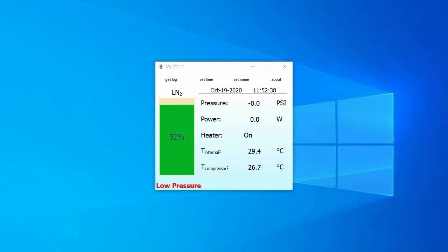If the Intelligent Cryo-Cycle unit has a warning or alarm, a descriptive message will be displayed at the bottom of the window. If there are multiple messages, the message will be followed by an ellipsis. Clicking on the ellipsis will open a new window that will display all messages. The user manual describes which actions you need to take depending on the error message.